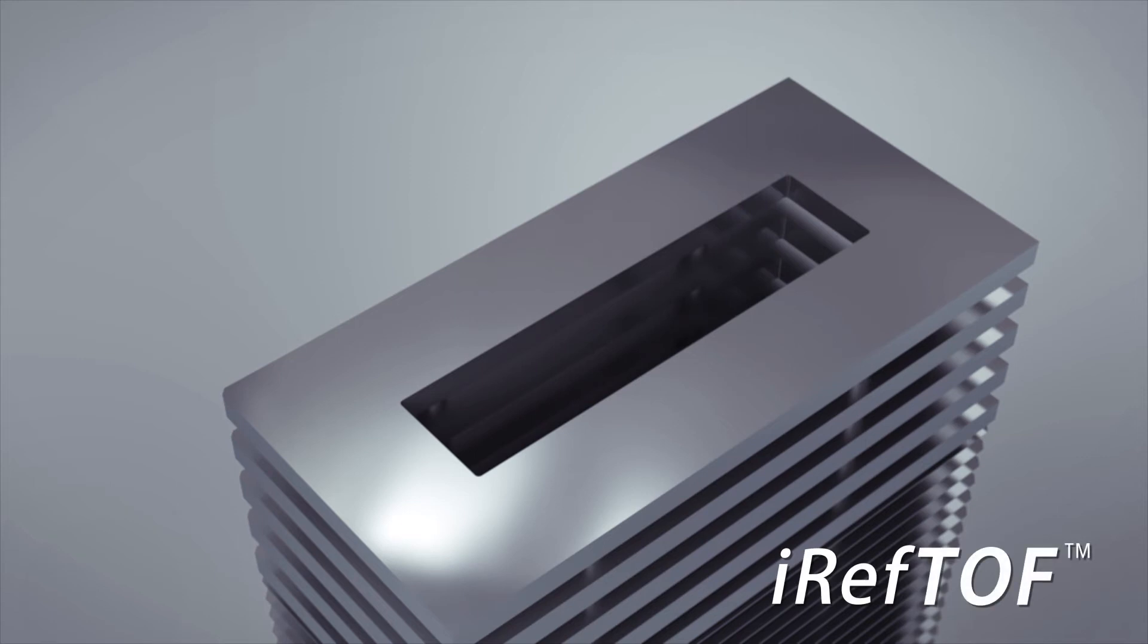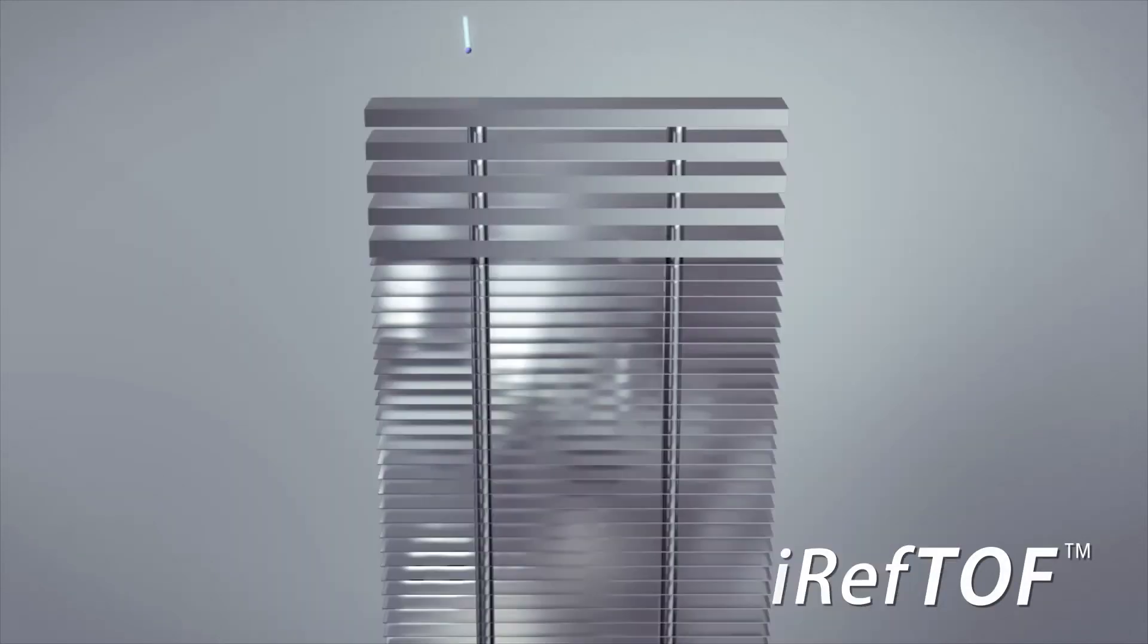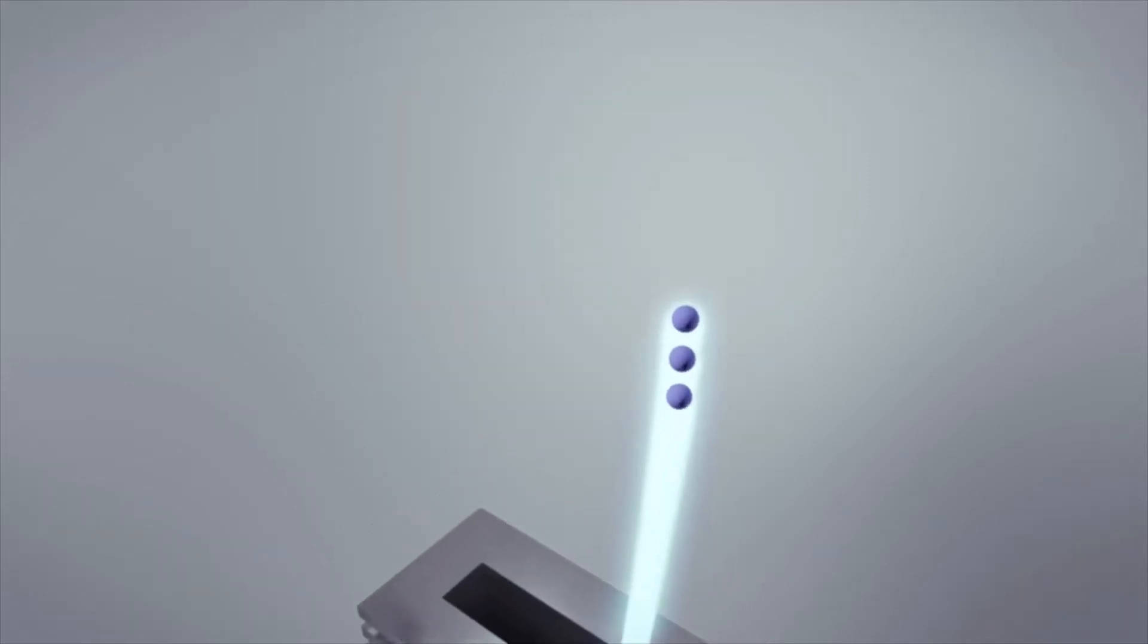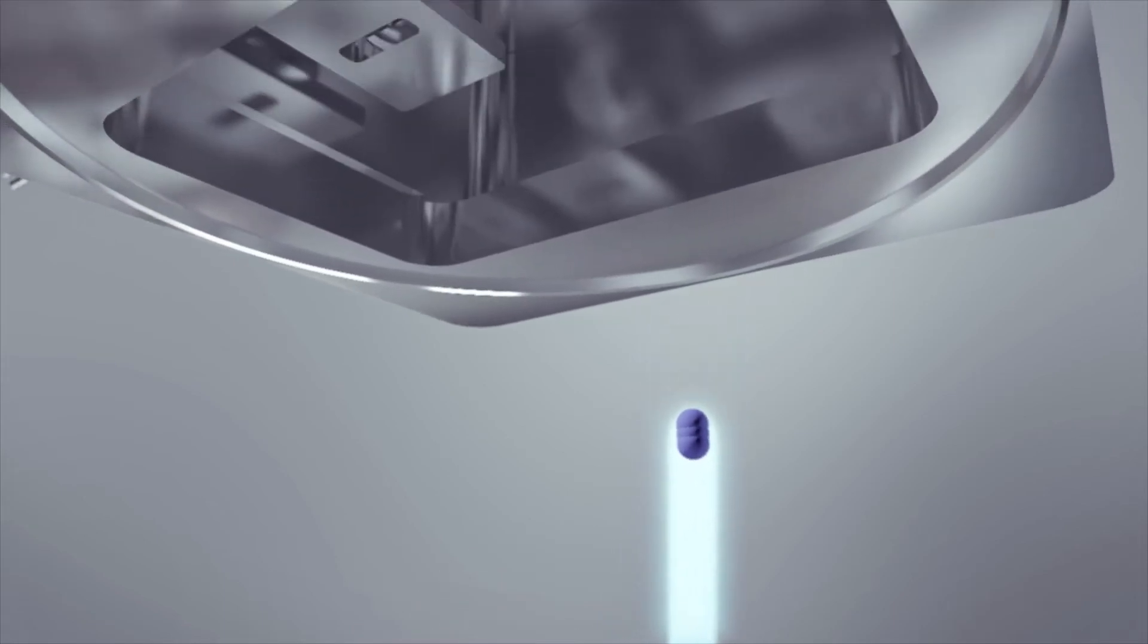In the UF flight tube, IREF-TOF, with its unique electrode arrangement, delivers the ideal reflectron field to correct ion trajectories into a singular focal point for maximum mass resolution.